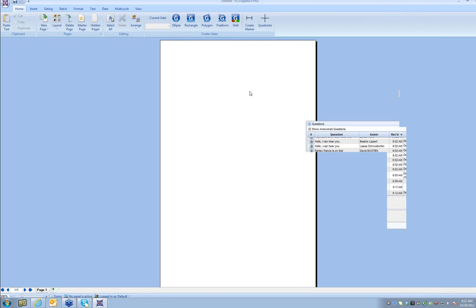At a high level, because we tried to do a data analysis and reporting software at the same time, we basically shamelessly and blatantly copy Microsoft PowerPoint. So you can see in front of us, this is FCS Express, but it looks a lot like PowerPoint, and you'll find that all of the shortcuts, all of the keys, everything, we try to copy the look and feel and style of PowerPoint, except that in PowerPoint you basically only put in text and pictures. In FCS Express, you also put in your plots and your gates and your statistics. But you do everything in a very similar manner.